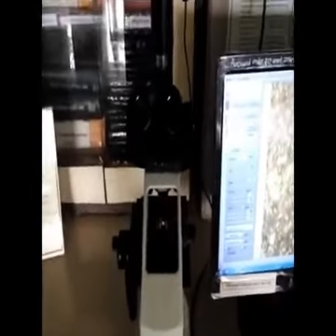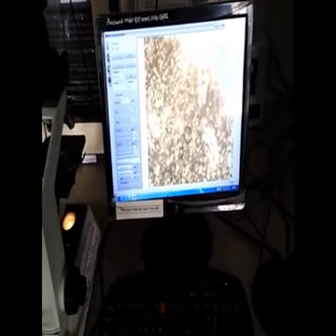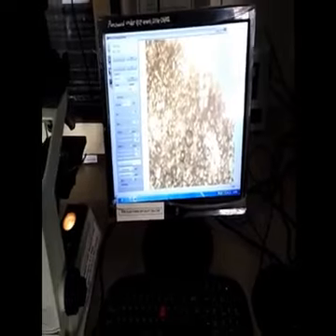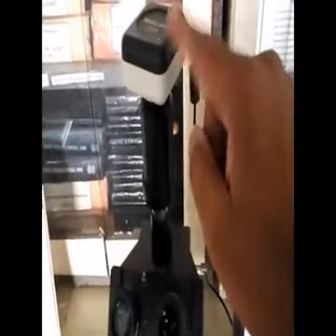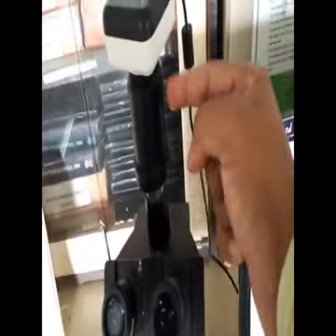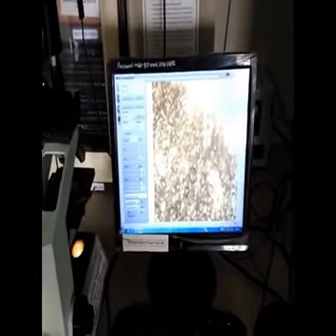Now this is how the image under the microscope appears on the screen. I'm showing you the live image because I cannot place the camera of my cell phone into the eyepiece, as it will not catch it properly. Whereas the camera attached to the microscope has a special attachment and lenses in the adapter. So this is the view of the surface of the leaf.